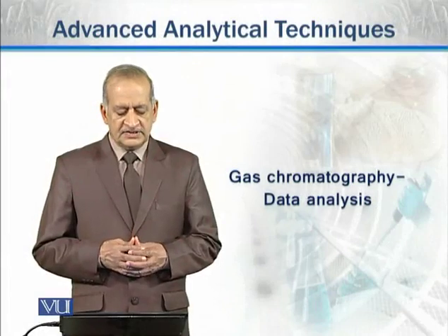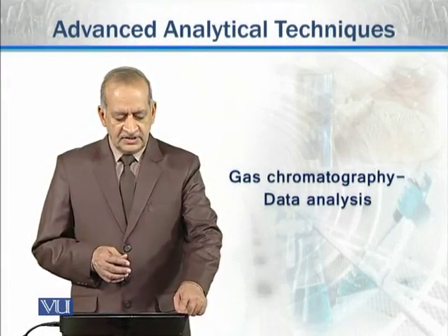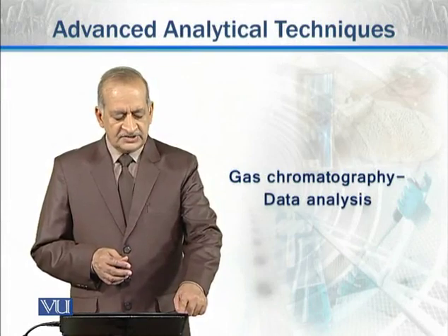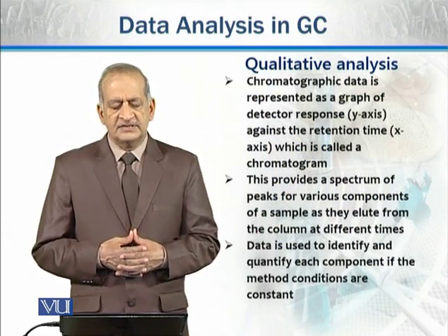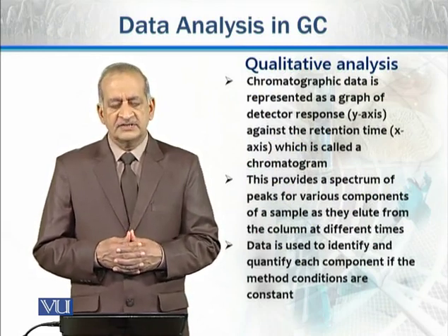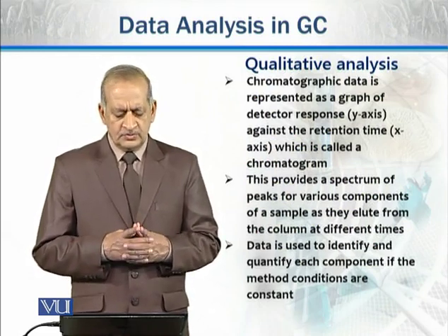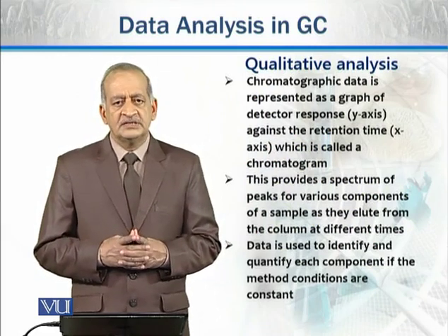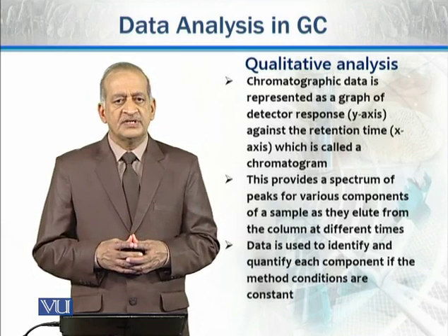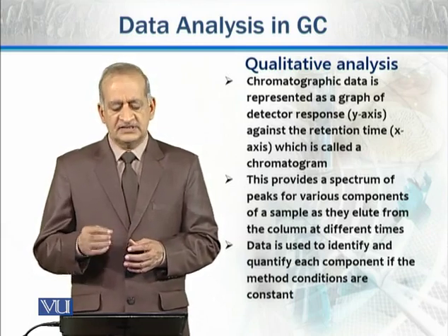Now we will discuss data analysis, how this data is analyzed in gas chromatography. There are two types of analysis, qualitative as well as quantitative. Qualitative first, when we are able to analyze the presence or absence of certain substances in the sample.